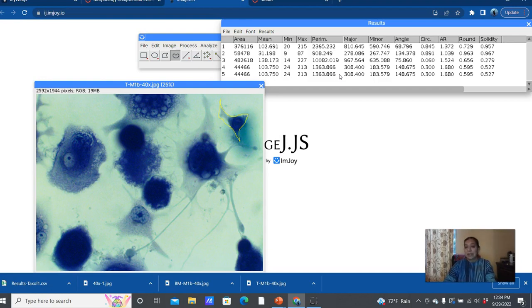We will have the slides available for you to look at, to have a physical experience with them next week, and then definitely in a couple of weeks when we go back into cell viability. So you will get to experience them with the microscope as well. In the meantime, you can explore ImageJ and get all the data that you need through that.